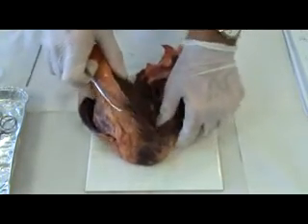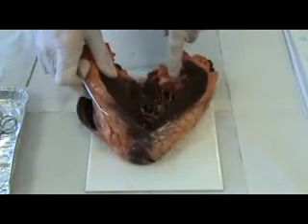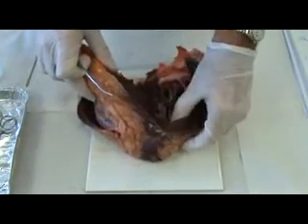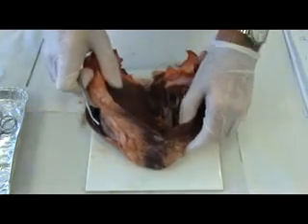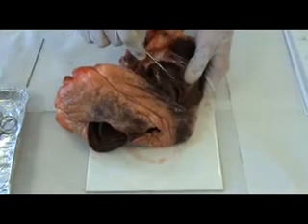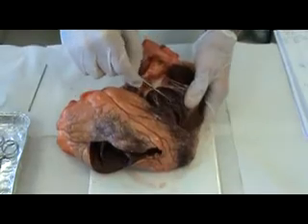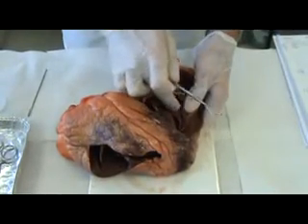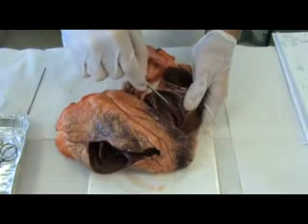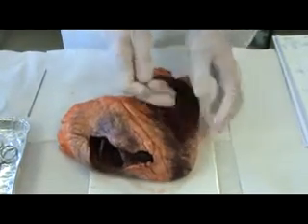As I said before, the left ventricle has to receive the blood from the left atrium, and when it fills, it's going to expand itself out a bit, stretch itself out. And if you hold the myocardium to one side, you can see some strand-like, bumpy bits there, and these are the trabeculae carneae, and these are quite useful to allow the chamber to stretch itself.